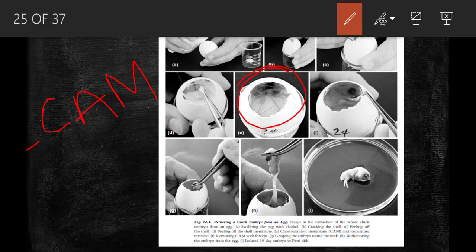This is referred to as CAM, the chorioallantoic membrane, where the blood vessels can be seen.